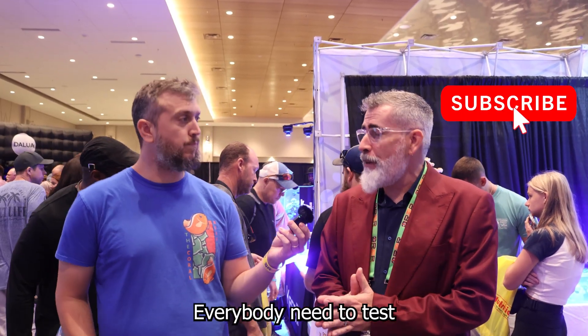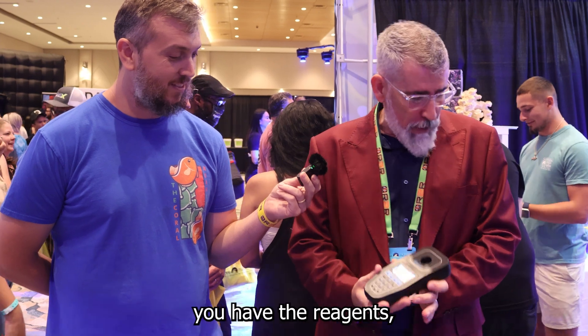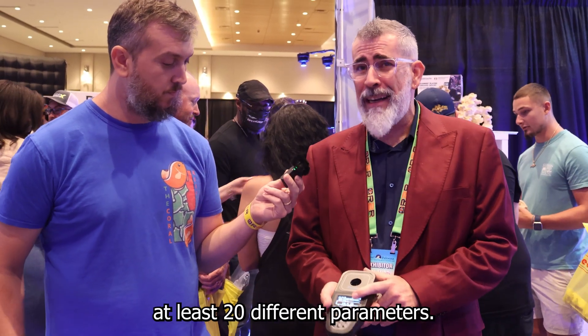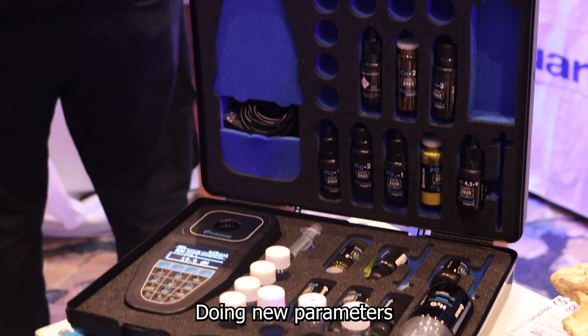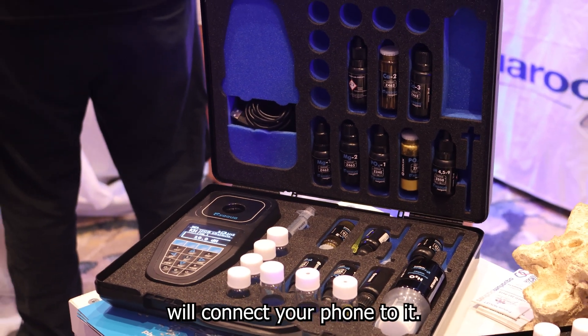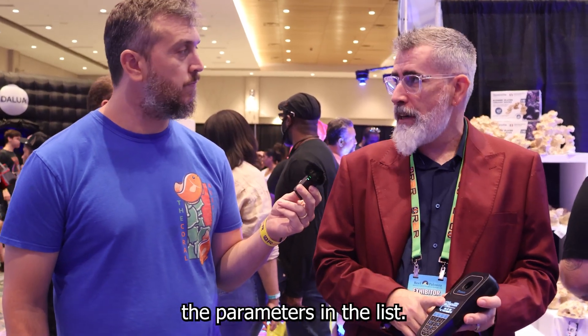Everybody needs to test their water but nobody wants to do it. With this, once you have the reagent, you can test at least 20 different parameters with one machine. Add new parameters by connecting your phone, make an update, and it's done — you already have the new parameters in the list.